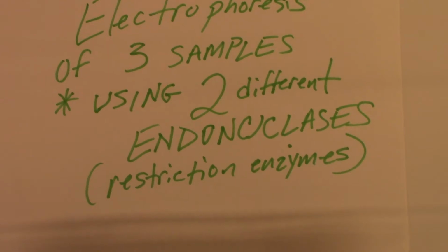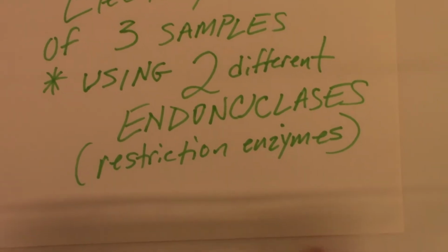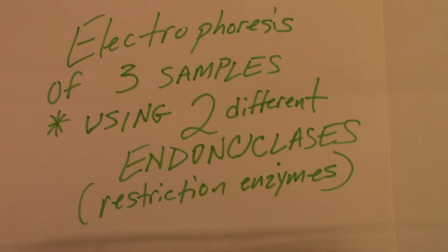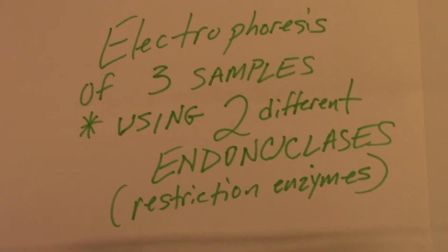Spelled nuclease wrong, I'm sorry. After the L there's an E, but that's okay because mistakes happen. And what you're going to see in a moment is even a mistake happened with this particular electrophoretic run.